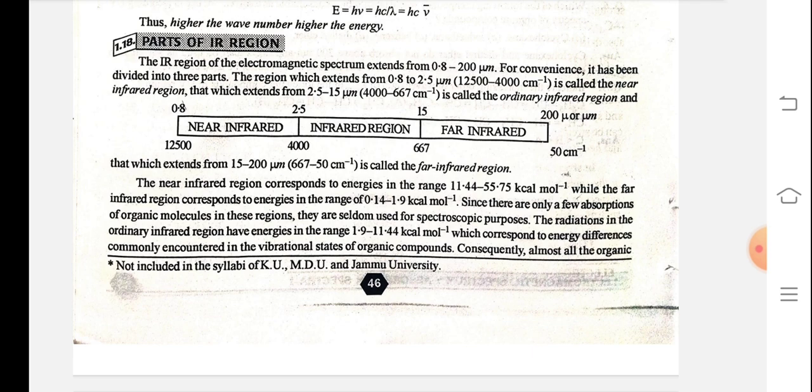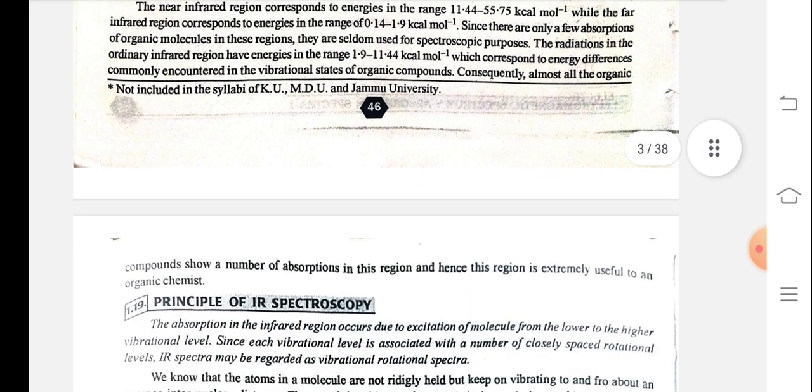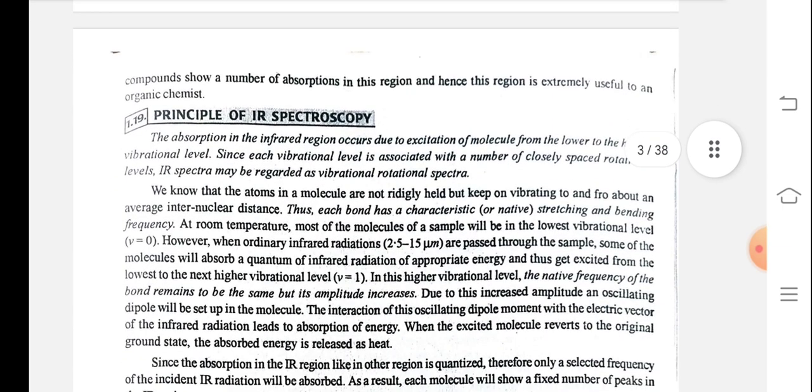which corresponds to energy differences commonly encountered in the vibrational states of organic compounds. Consequently, almost all organic compounds show a number of absorptions in this region, and hence this region is extremely useful to an organic chemist.